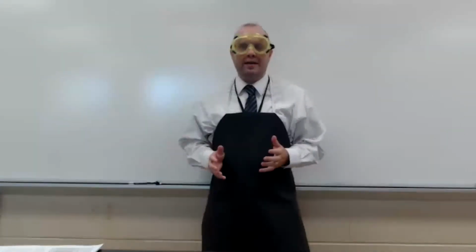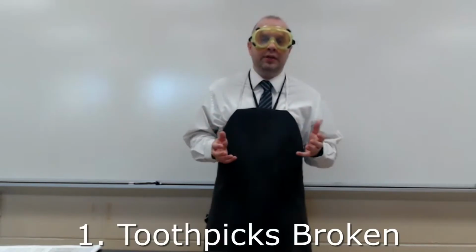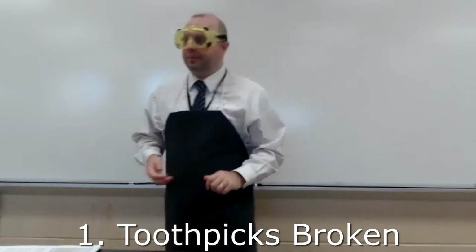All right, I am back with my lab apron and goggles, and I am ready to go for our first experiment. In the first experiment, it says that we are going to take toothpicks and break them. So let's take a look.